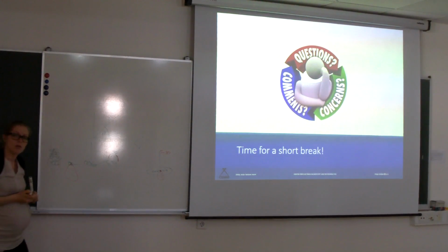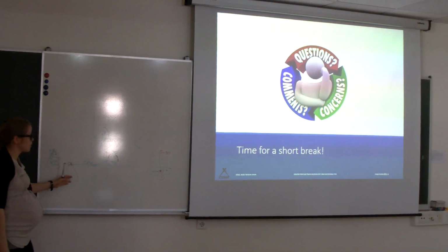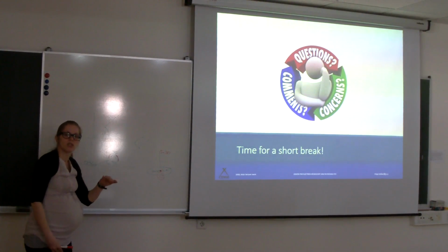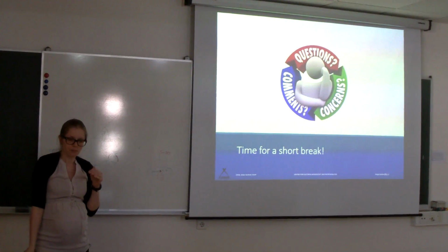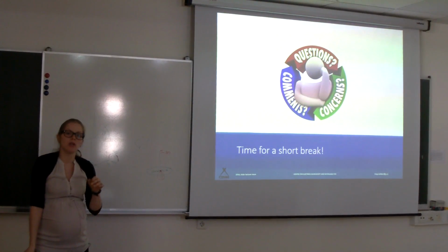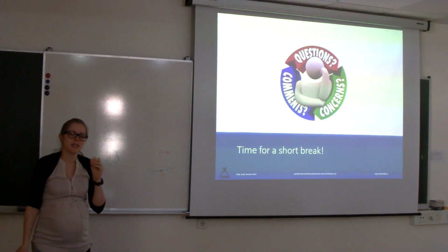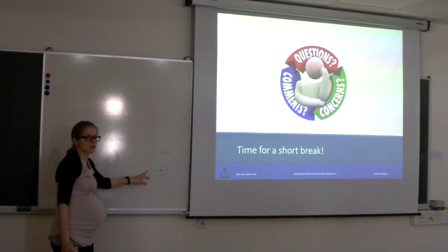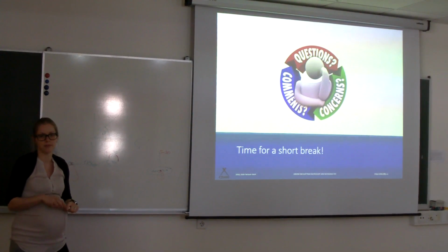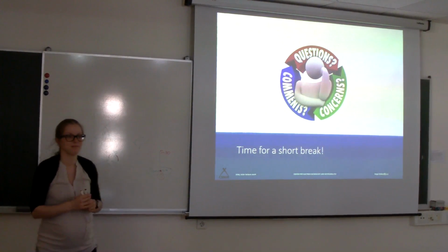So this is a special holder. What should I use for this? In this case you would always use the carbon holder, but this is STEM, a different unit. We want to have it on our new microscope, but we don't have it yet. It's on film. You also have lower counts here. But if you have nanoparticles, STEM or TEM is better. Okay, thank you.